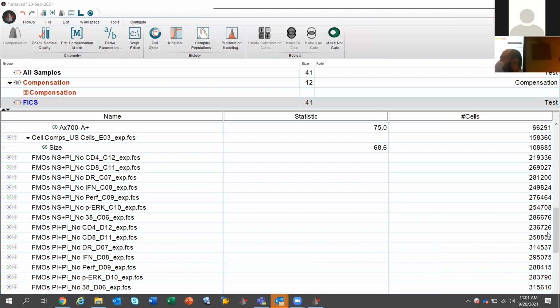Yes, Howie? I'm not sure which version of FlowJo you're on, but it doesn't cover the brightness, right? And for the brightness, we have a new matrix called the TSM. That's when you click on the button, and that removes the brightness aspect of it. And so you are getting a true spread value. Okay, so Howie is letting me know that there's a new version of FlowJo that actually is taking into account brightness. So if you remember, brightness is what causes it. If it's too bright, it's going to increase your spread. So that will go ahead and start taking into account your spread.